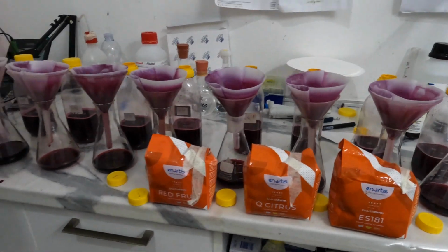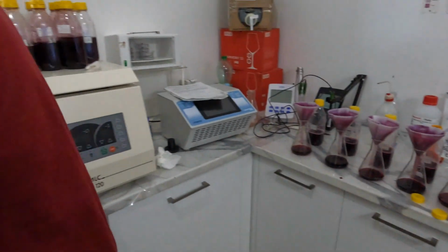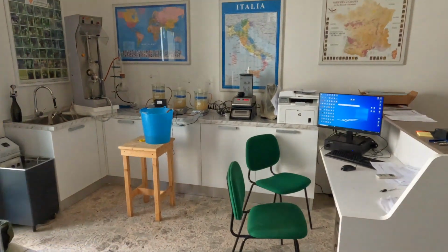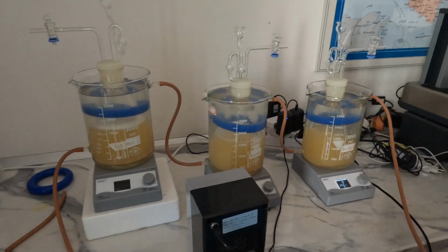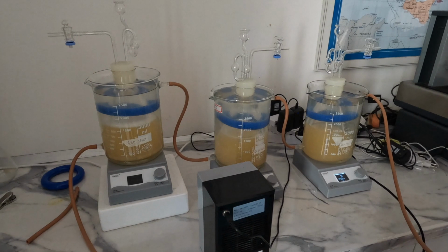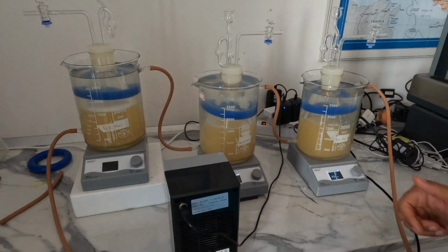So now we are testing these different types of yeast in this complex, because at the end of the fermentation we evaluate which is the best type of yeast to use in this case, on the white must. Gotcha.